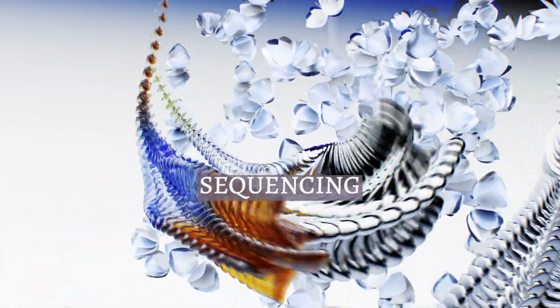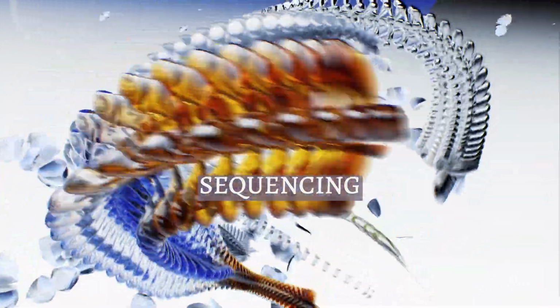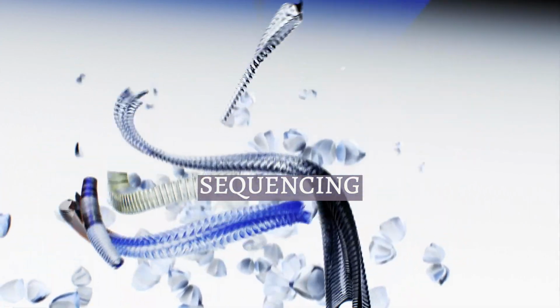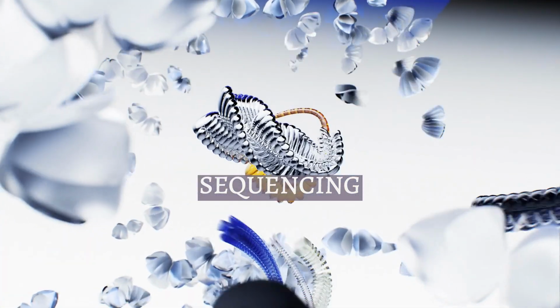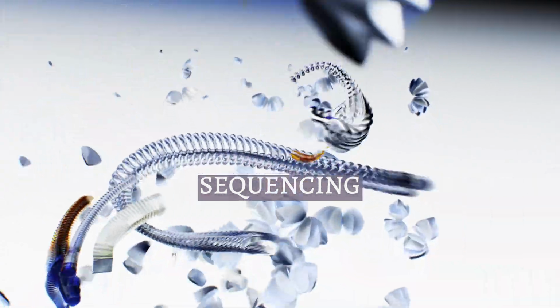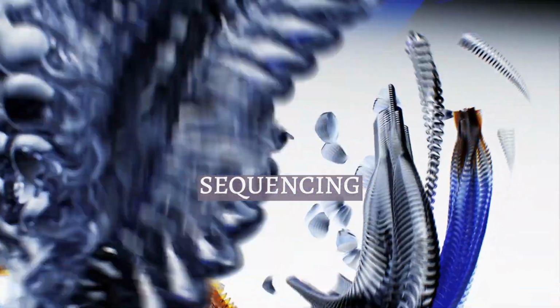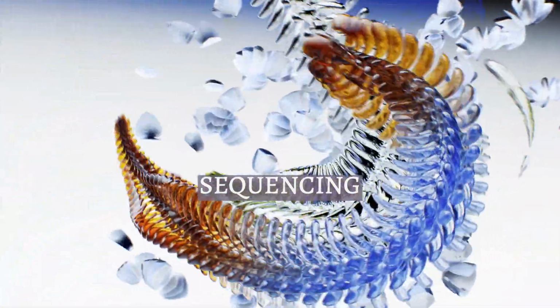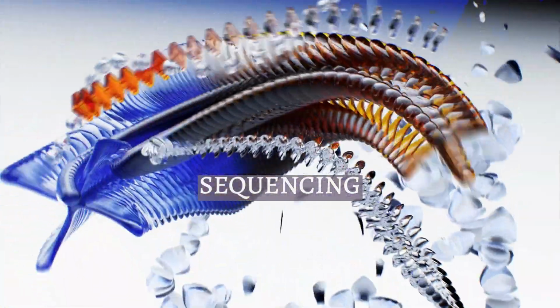The actual RNA sequencing varies significantly depending on the platform used. Three common next-generation sequencing platforms are pyrosequencing on the 454 Life Sciences platform, polymerase-based sequencing by synthesis on the Illumina platform, or sequencing by ligation on the ABI SOLiD sequencing platform.